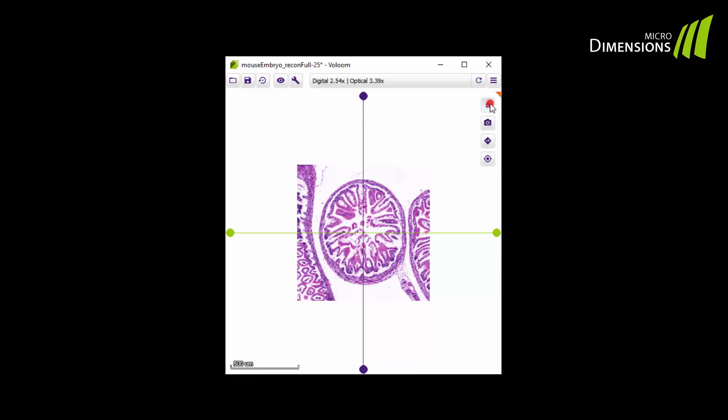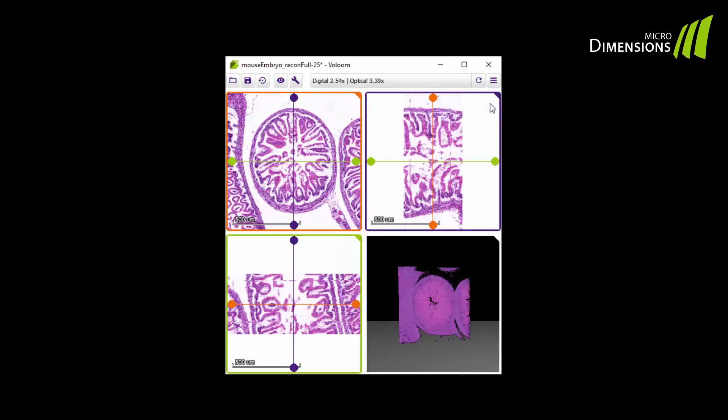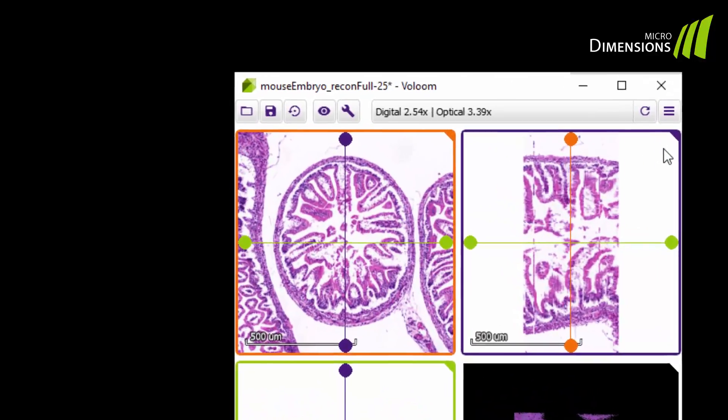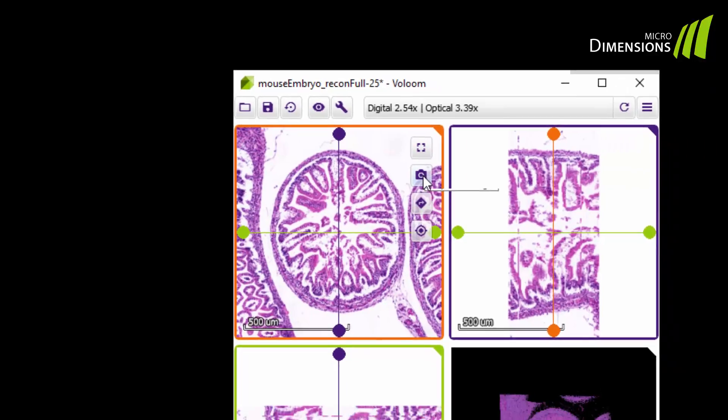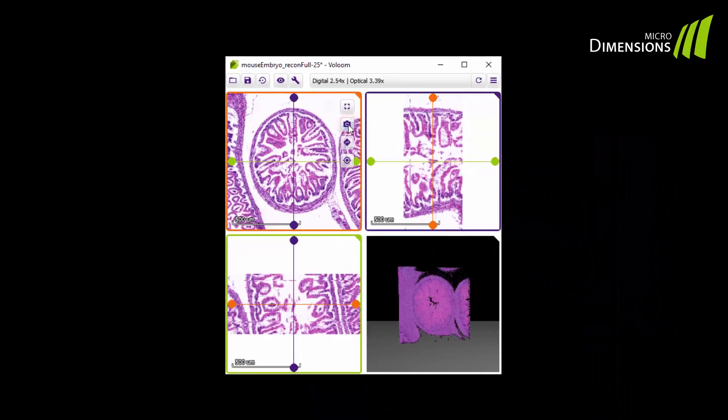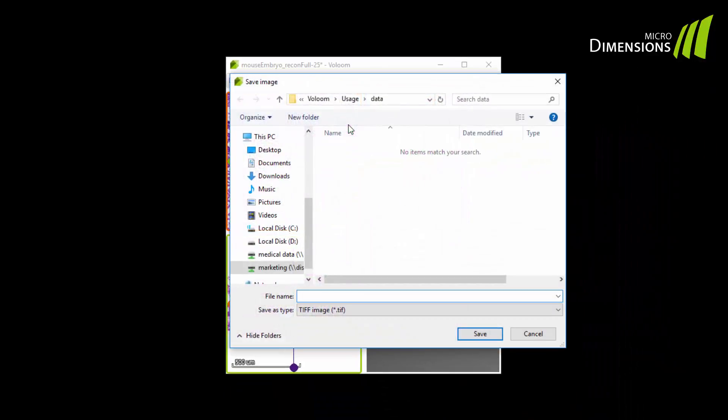You can also take a snapshot of the respective view. After clicking, an explorer window will open and you can save the snapshot at the desired location.